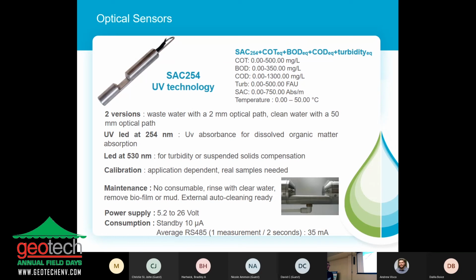And being optical, it's very important to keep it clean. We don't have a wiper directly, but we use an air blow to keep the optical parts clean. There is an external port available for you, so you connect a compressor network, and with a solenoid valve, you activate some blowing over time, and you keep the sensor clean.